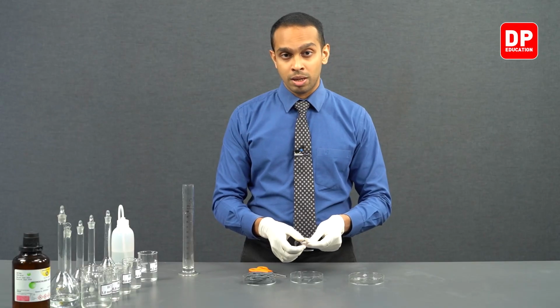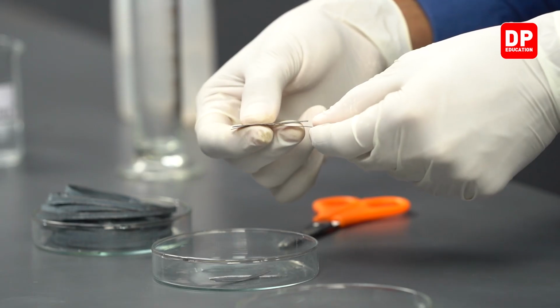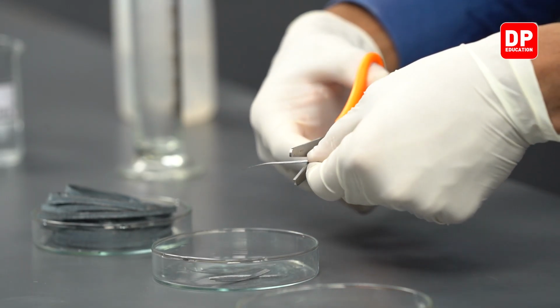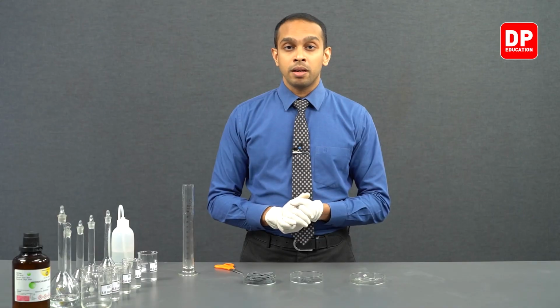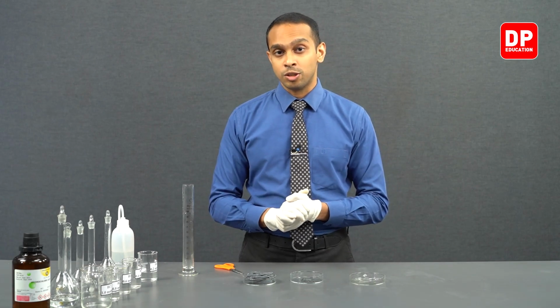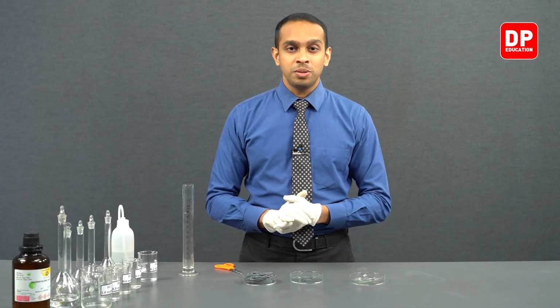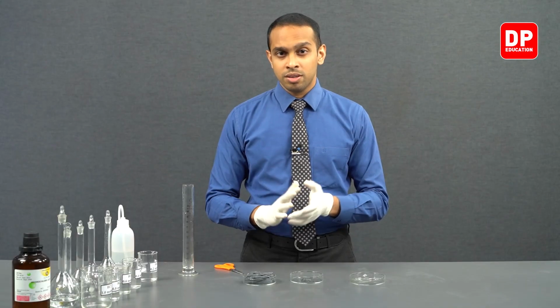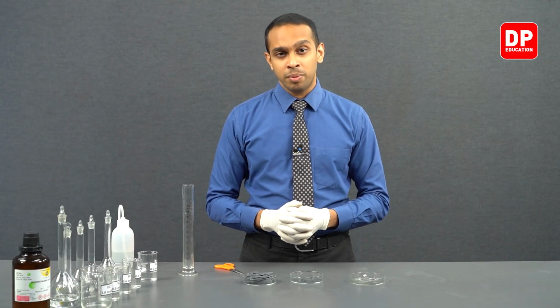To ensure that they have the same surface area, we are going to measure magnesium pieces by their length. So if you get a few magnesium pieces with the same length, you make sure that the surface area that is exposed to the acid is going to remain a constant. When you keep the length of the magnesium strips a constant, the surface area exposed to the acid is going to remain a constant.